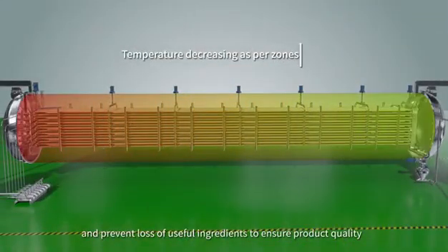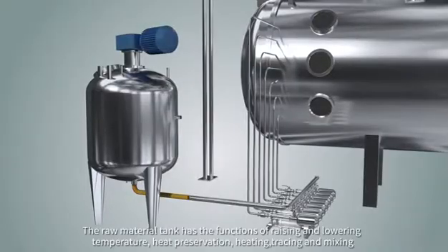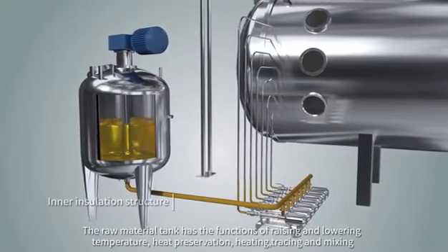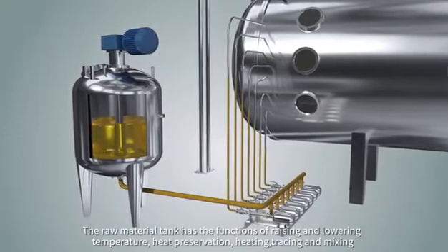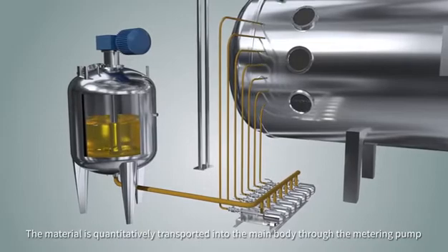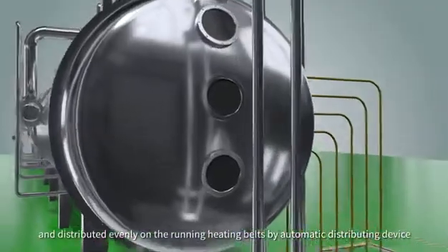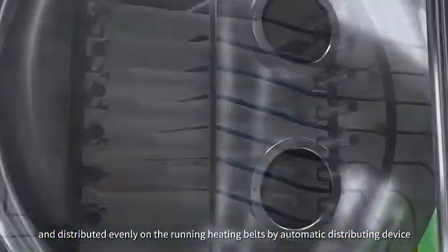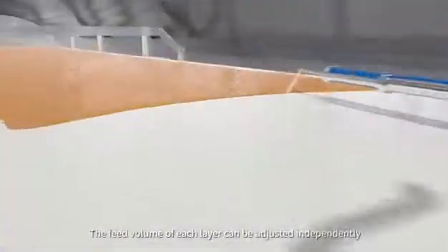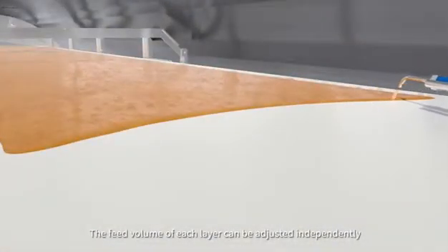Flexible control of material temperature prevents damage caused by overheating to material structure and prevents loss of useful ingredients, ensuring product quality. The raw material tank has the functions of raising and lowering temperature, heat preservation, heating, tracing, and mixing. The material is quantitatively transported into the main body through a metering pump and distributed evenly on the running heating belts by an automatic distributing device. The feed volume of each layer can be adjusted independently.